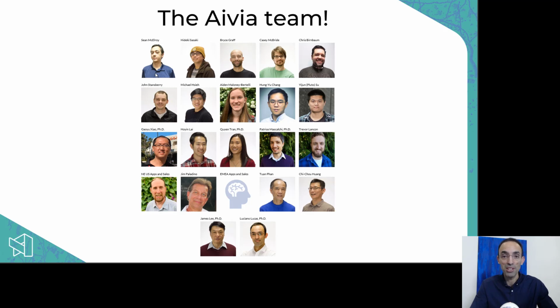And there's even more that we didn't present today simply for time concerns. But we'll have another opportunity soon to give you a bigger taste of what Aivia 9.8 can do, and I'll mention a little bit more about that in a moment.